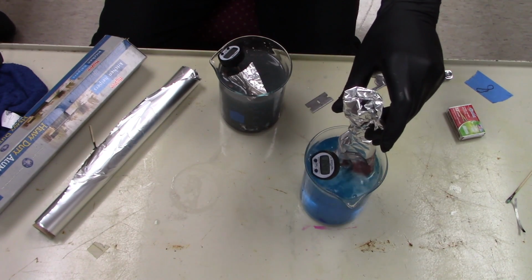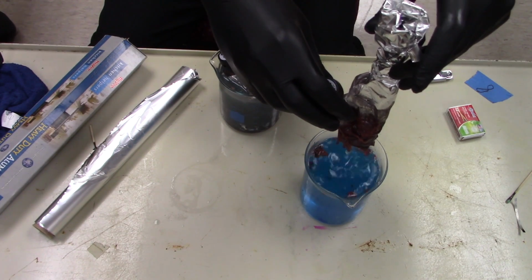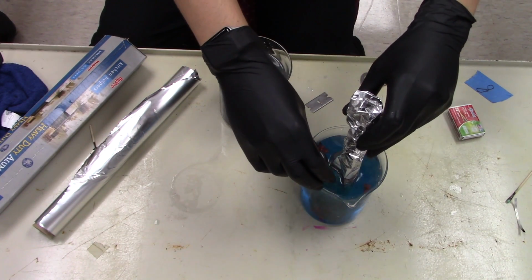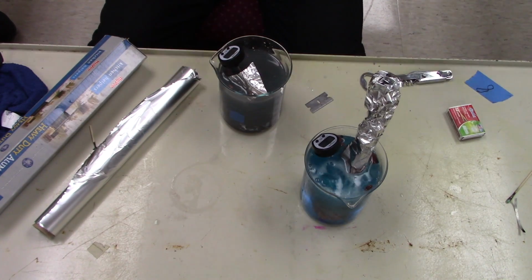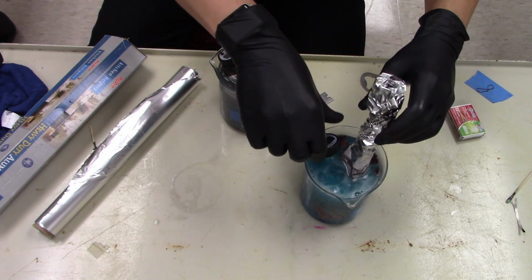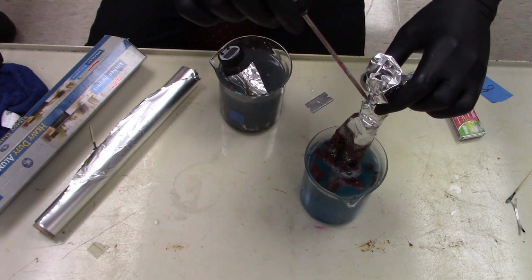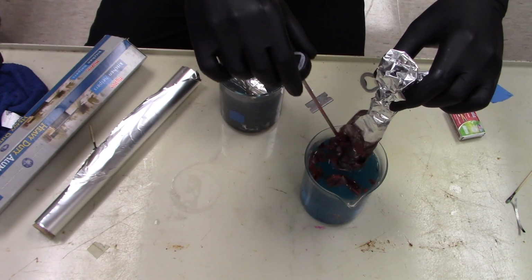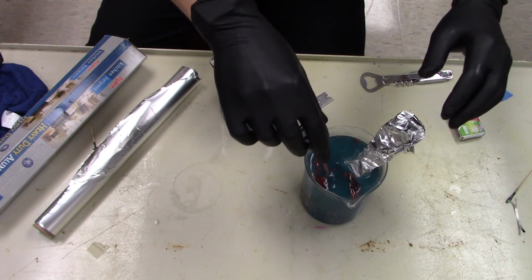But if I pull this out of here, see how the copper's already forming on there? So really quickly, atom by atom, the copper is being pulled out of the solution and just turning into raw solid copper. That's going really quickly. That's going a lot faster than it did last time I did this. So anyways, pure aluminum, and now as it turns into copper, it gets all crummy. And so it sits there.